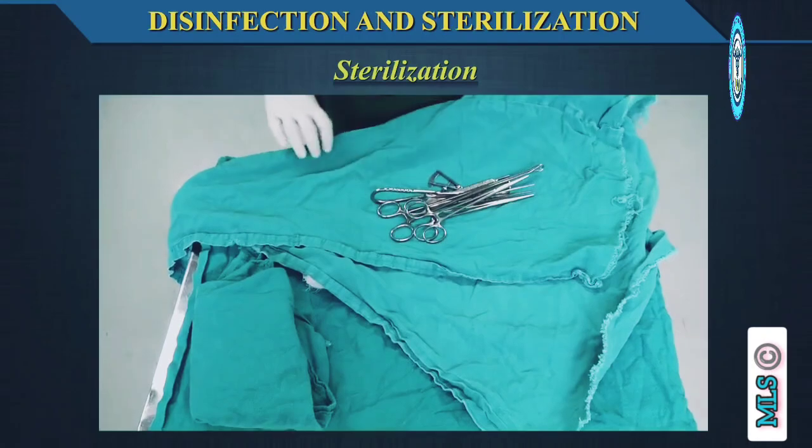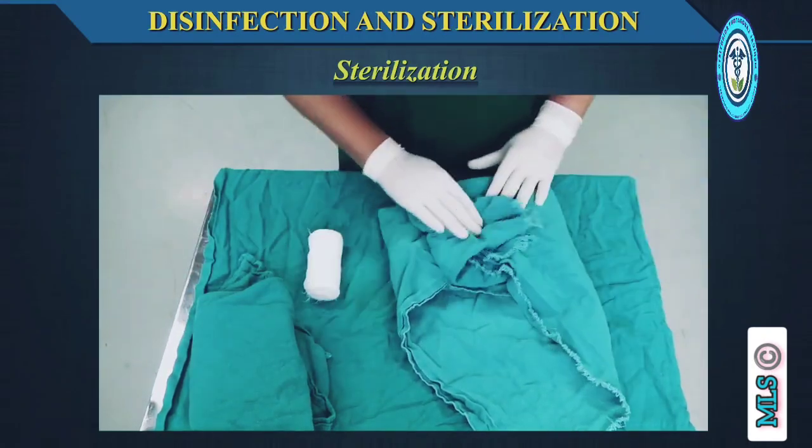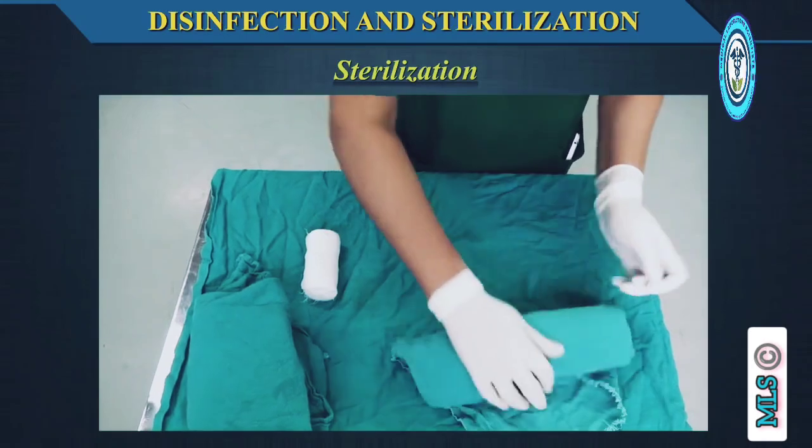All materials must be wrapped before sterilization. Only wrapped or packed sterilized materials should be described as sterile.